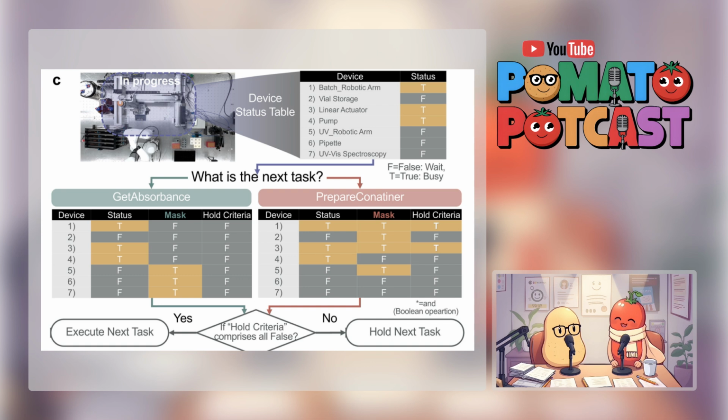Okay, user optimal scheduler. That sounds like it's at the heart of what makes OCTOPUS so special. But just how much better is it than running experiments the old-fashioned way? Well, the researchers actually compared it to the traditional first-come, first-served approach, and let me tell you, the results are impressive. Okay, I'm all ears. Hit me with those results. All right, so the user optimal scheduler really shines when it comes to job waiting time. That's the time an experiment has to wait in the queue before it can actually start.